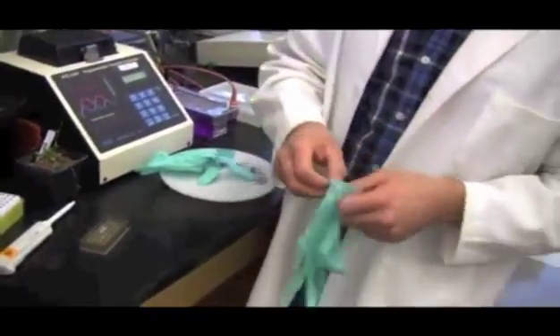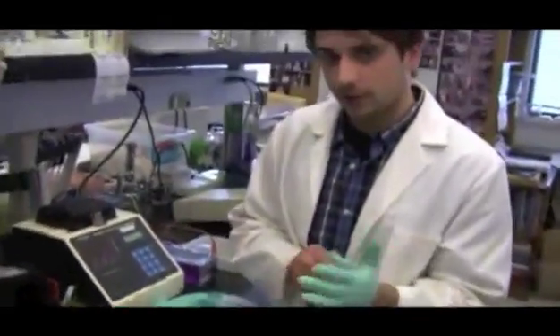And so, DNA is negatively charged, and you guys may have a question about this on your worksheet. The gel is basically just a bunch of teeny tiny little molecules that the DNA has to weave in and out of in order to go through. So if, like I said, DNA is negatively charged and we can put a charge through that gel, we can end up dragging the DNA through it. And so I want you to think about that for a second and answer a question. If DNA is negatively charged, which direction is it going to follow on the charge?